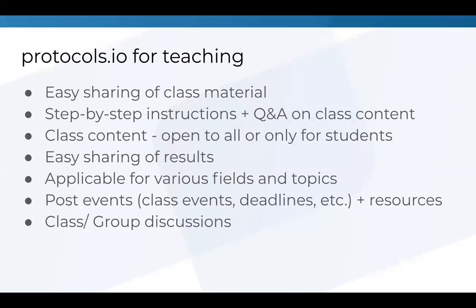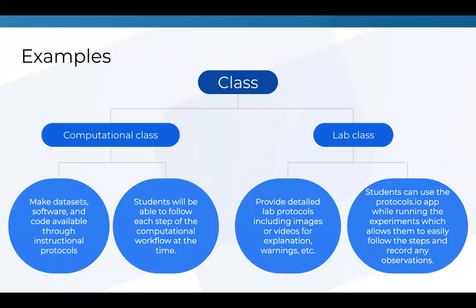And you can also, in the groups, if you have a group for your class, post events such as important class events, deadlines, etc. And you can add resources to it as well. And then the class can have discussions in the discussion space. And here are just 2 examples of what this could look like.